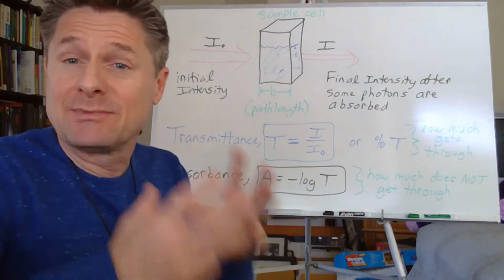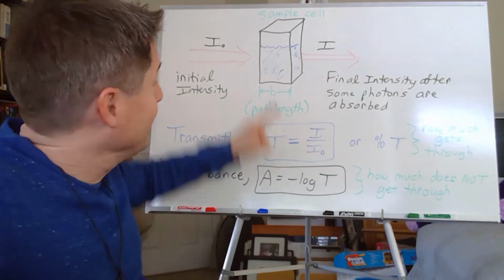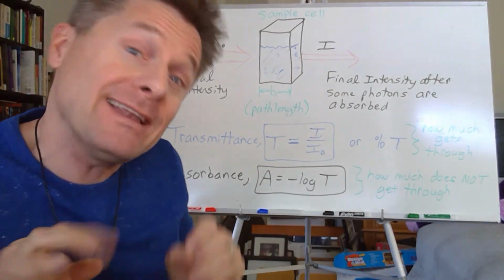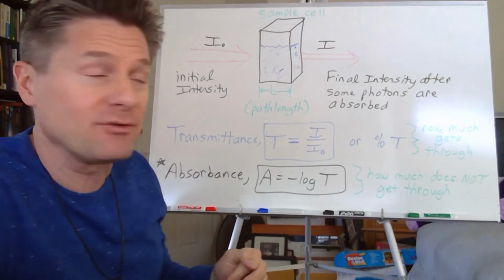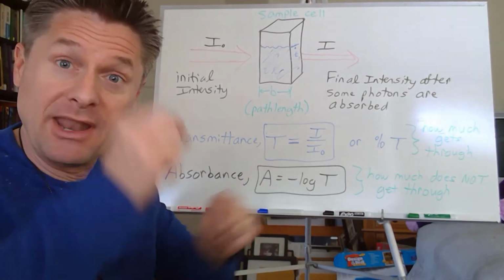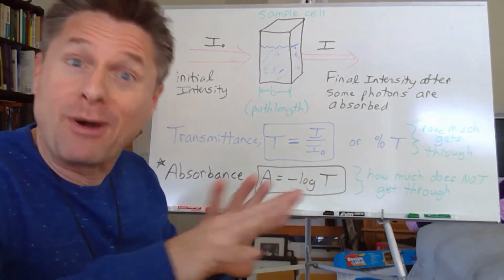So imagine we take some sample. In our case, we're going to put a solution in a little holder called a sample cell, specifically a cuvette, by the way. Really fun to put that in the spectrophotometer. It's going to be fun when you can actually see the spectrophotometer in lab, open it up, and we'll show you all the different parts and components and let you run it.